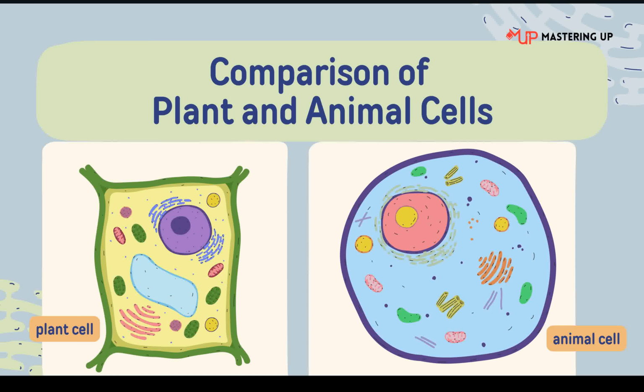The cell wall of plant cells is made of cellulose. It helps maintain the shape of the cell and also resist internal pressure changes, which is important when the plant takes in water.